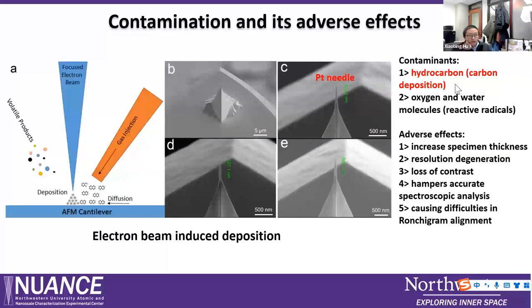Another thing you should pay attention to is oxygen and water molecules, because these are also unstable under the electron beam. There will be many reactive radicals, and this will introduce many artifacts.